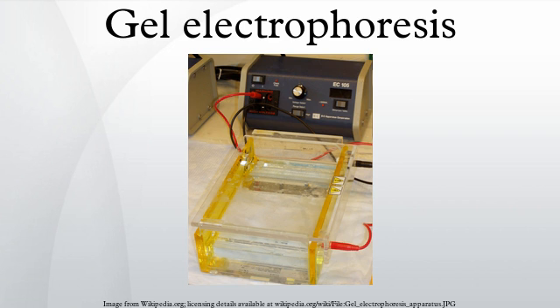Most SDS-PAGE protein separations are performed using a discontinuous buffer system that significantly enhances the sharpness of the bands within the gel. During electrophoresis in a discontinuous gel system, an ion gradient is formed in the early stage of electrophoresis that causes all of the proteins to focus into a single sharp band in a process called isotachophoresis. Separation of the proteins by size is achieved in the lower, resolving region of the gel. The resolving gel typically has a much smaller pore size, which leads to a sieving effect that now determines the electrophoretic mobility of the proteins.